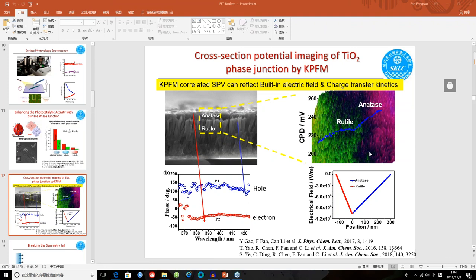So long story short, with the SECM probe, yes, we can do nano-electrical measurement in liquid, and we have a lot of examples. I would encourage you to check out our past webinars. Any webinar talking about nano-electrical measurement in liquid or SECM has this kind of information.